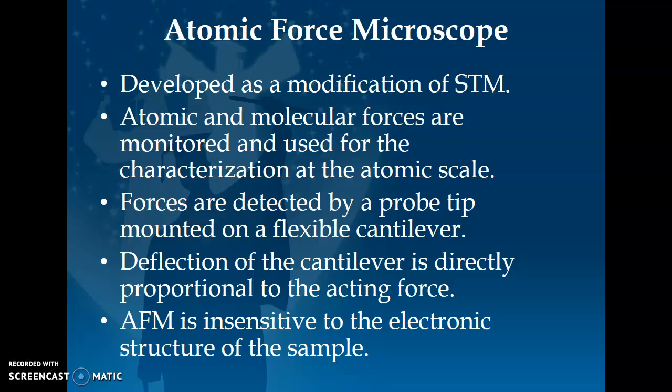Okay, in the last class we studied the scanning tunneling microscope, and now we are moving on to another type of microscope. It is the atomic force microscope. It was actually developed as a modification of the scanning tunneling microscope for dielectric materials.